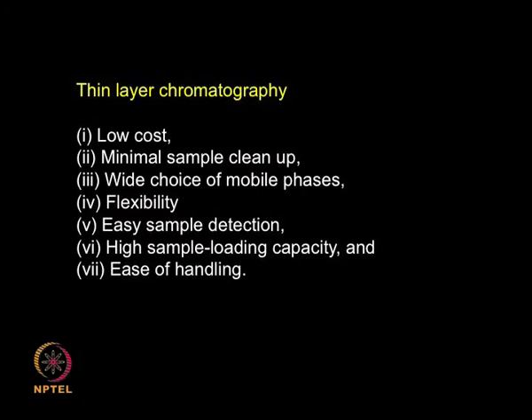Right. Now, a well known chromatography which is practiced by organic chemists for the past 50-60 years is called TLC, thin layer chromatography. It is low cost, it treats a minimum sample, so cleaning up is easy, we can use a wide choice of mobile phases, it is very flexible, easy sample detection, we can even load high samples and ease of handling. So, all these are very very advantageous which leads to the use of TLC by all the organic chemists.